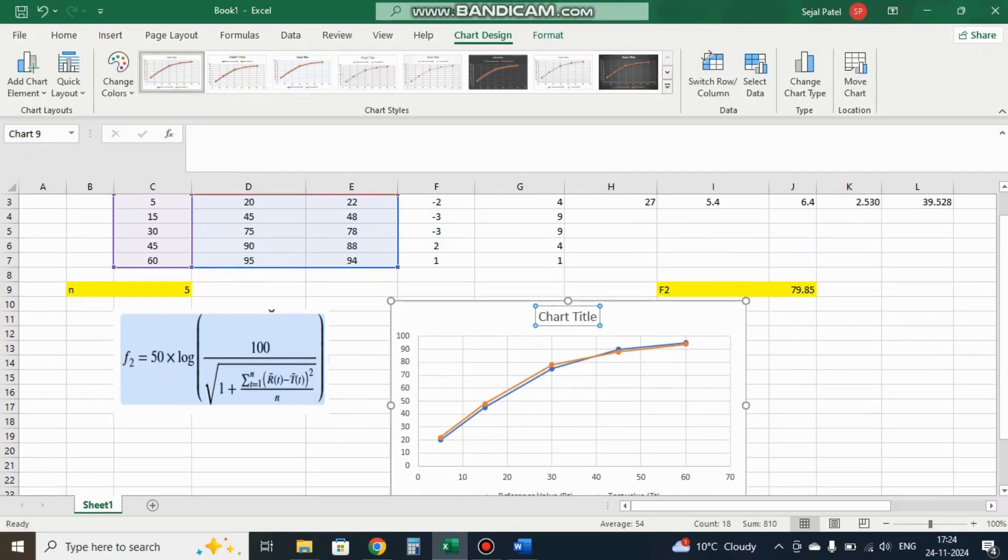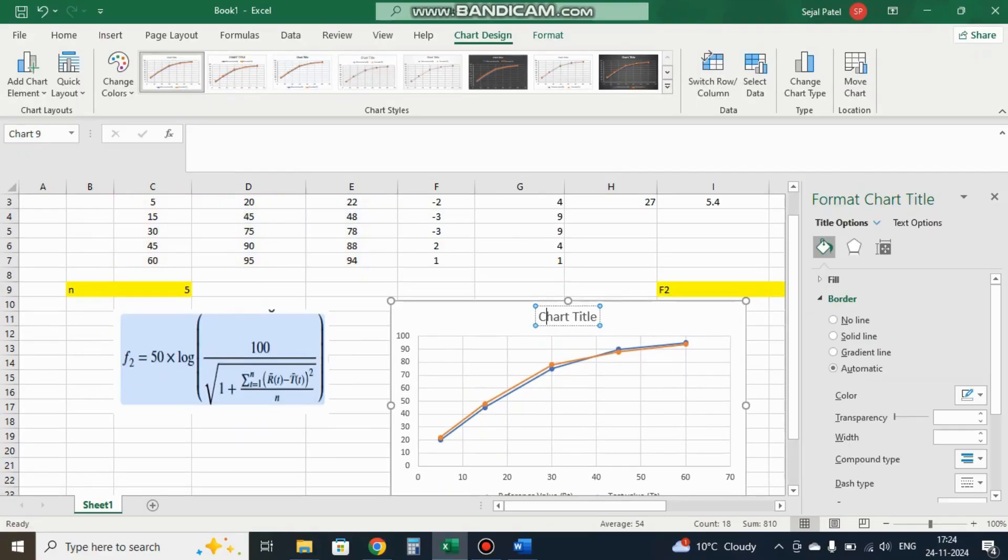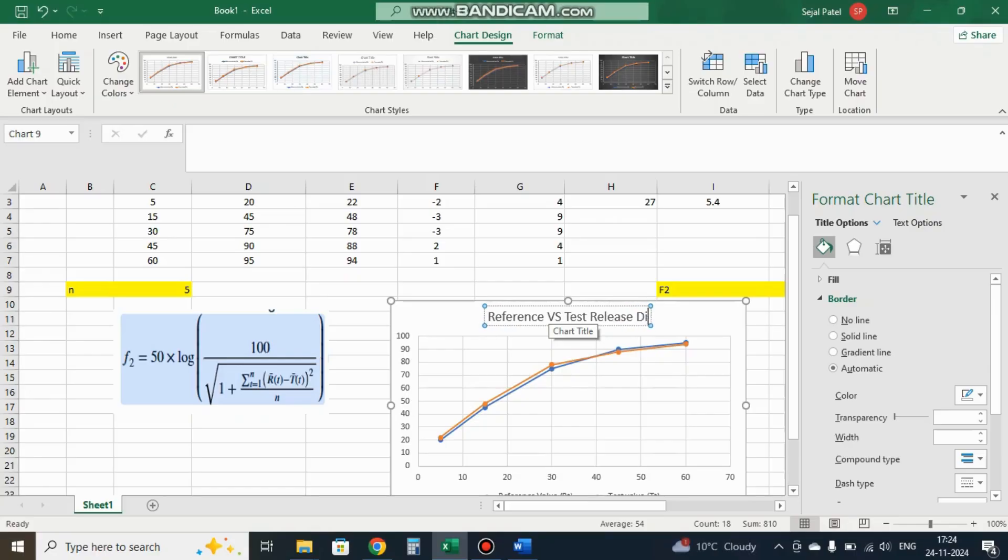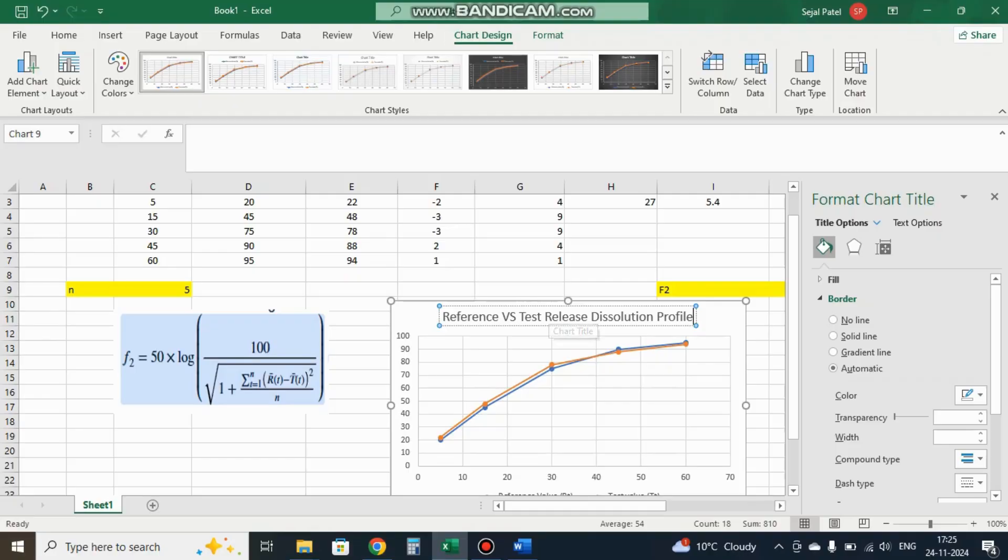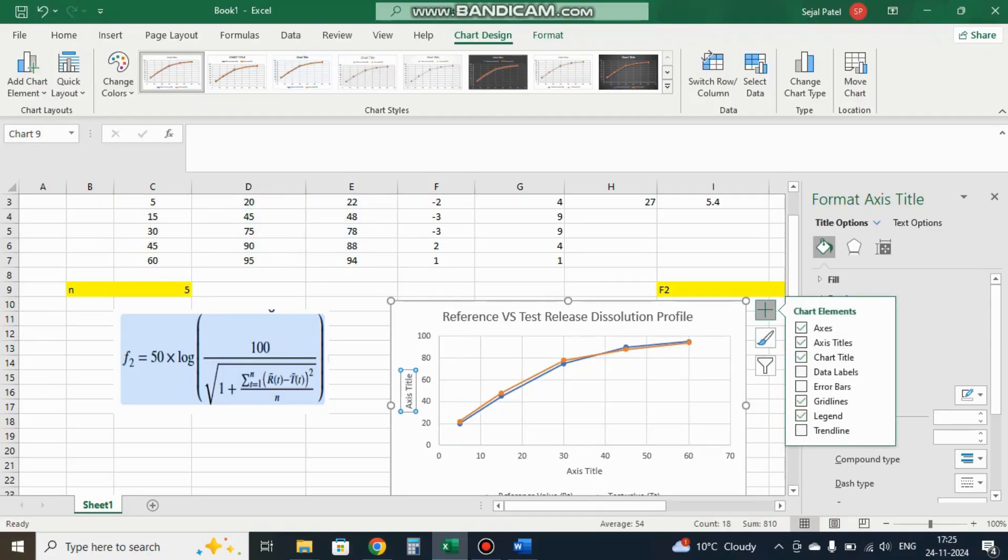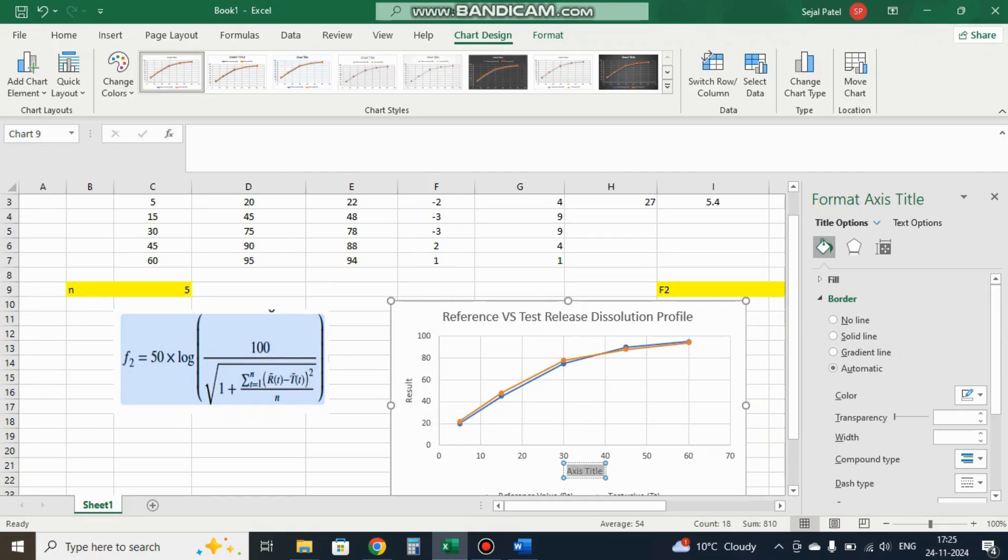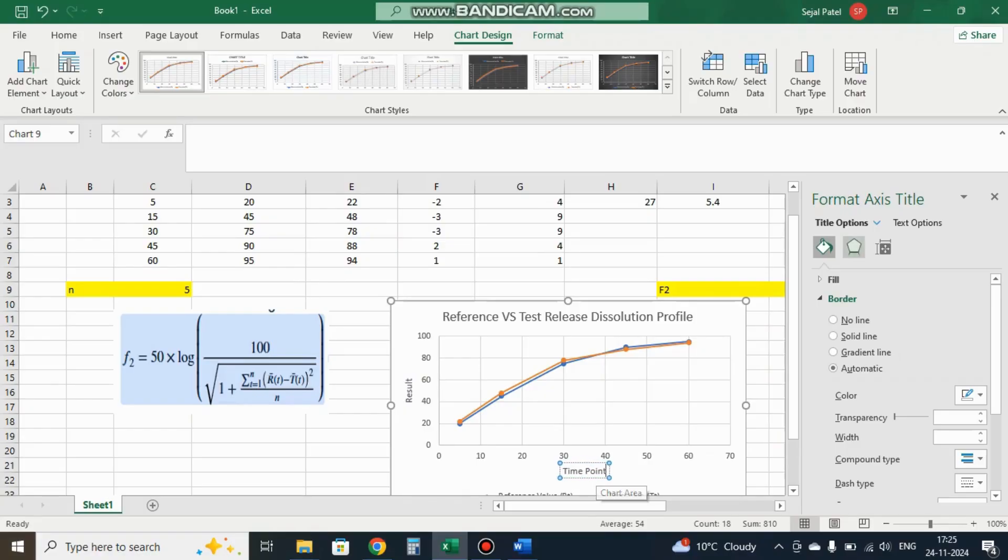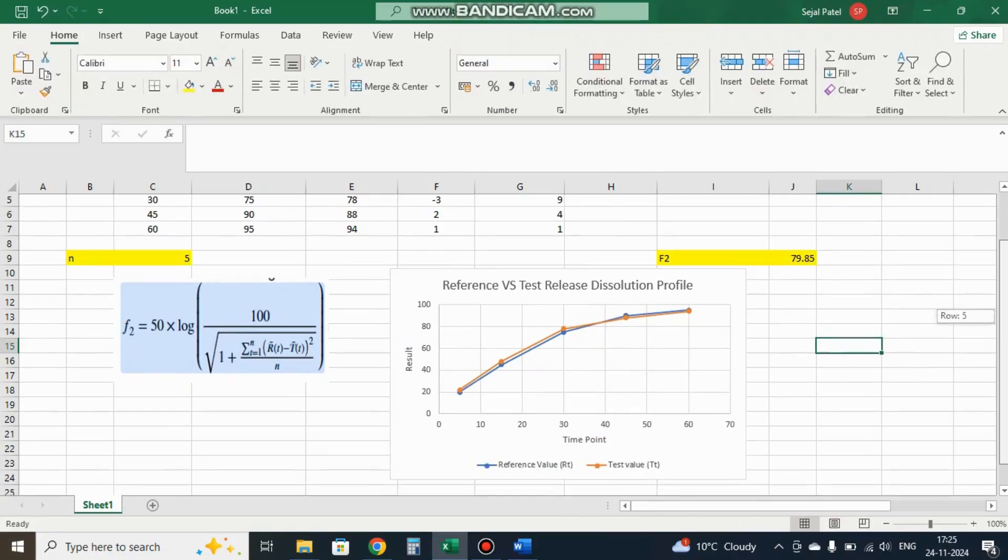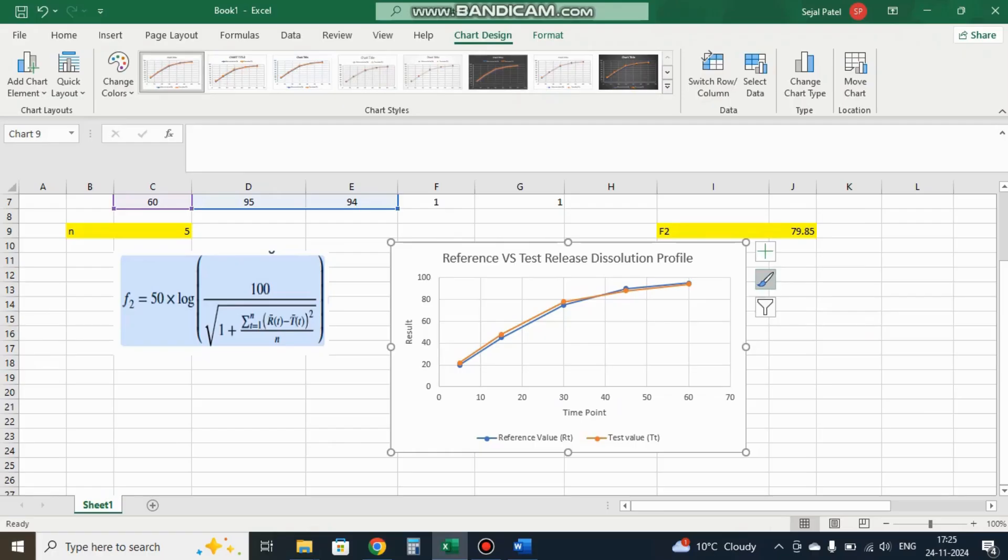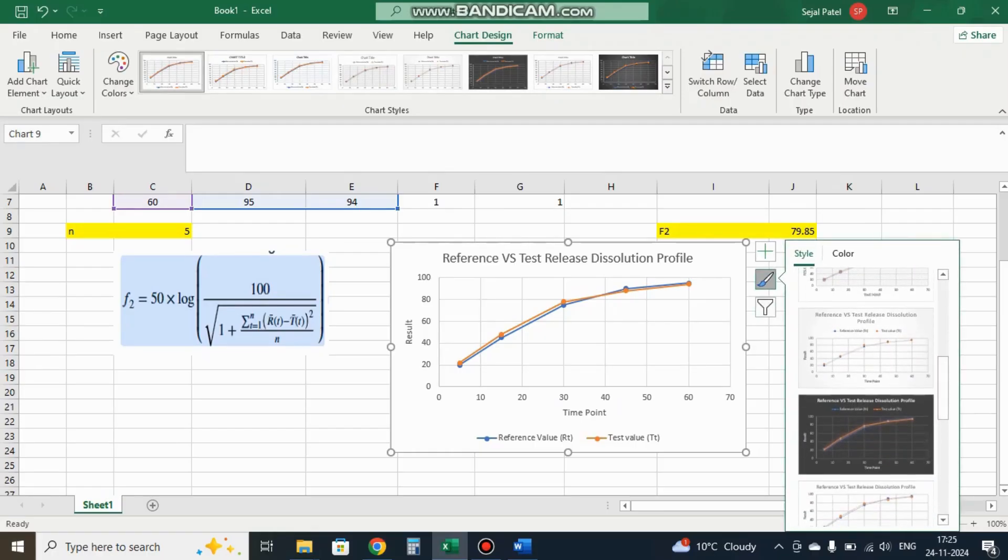We add a title: Reference versus Test Release Dissolution Profile. Then we add axis titles: y-axis is Result and x-axis is Time Point. You can change the colors according to your requirements. Now our F2 calculation and release pattern graph is ready.